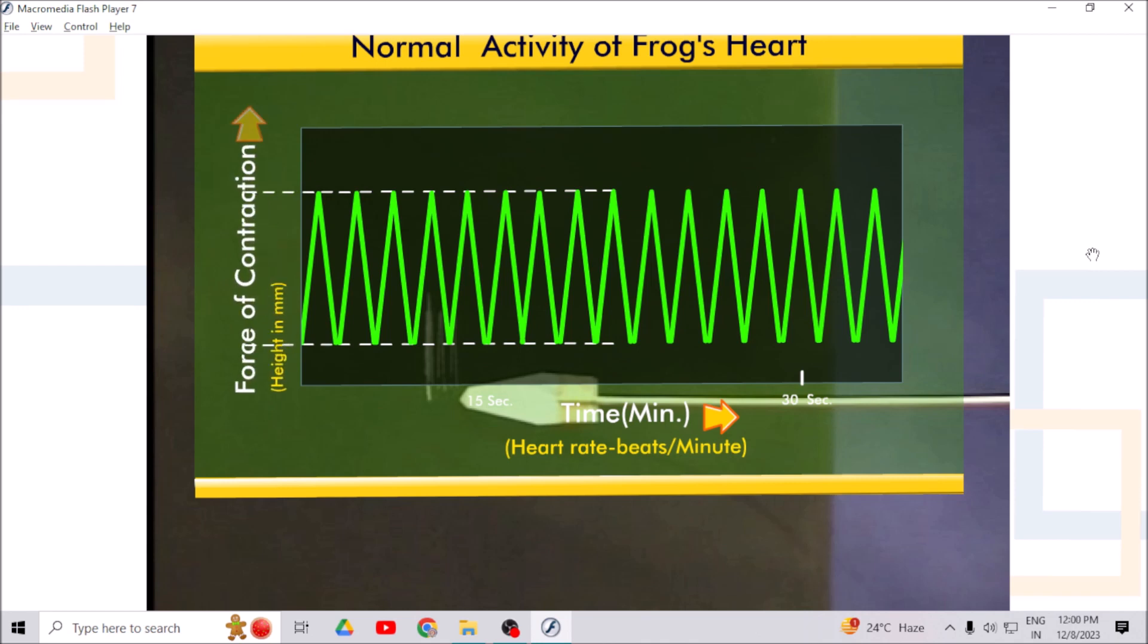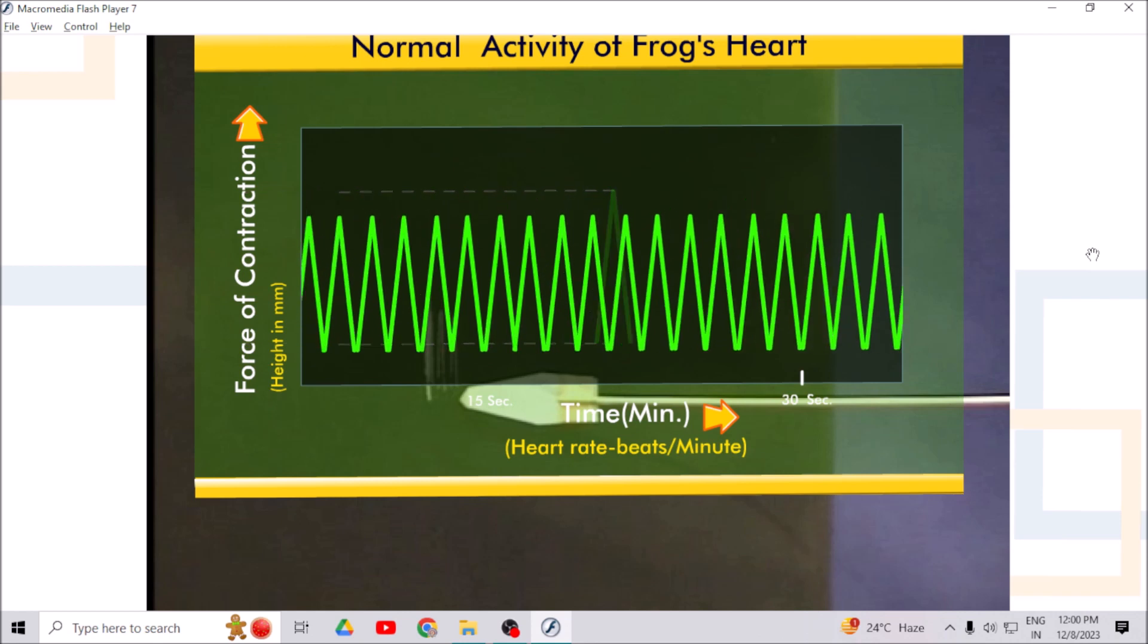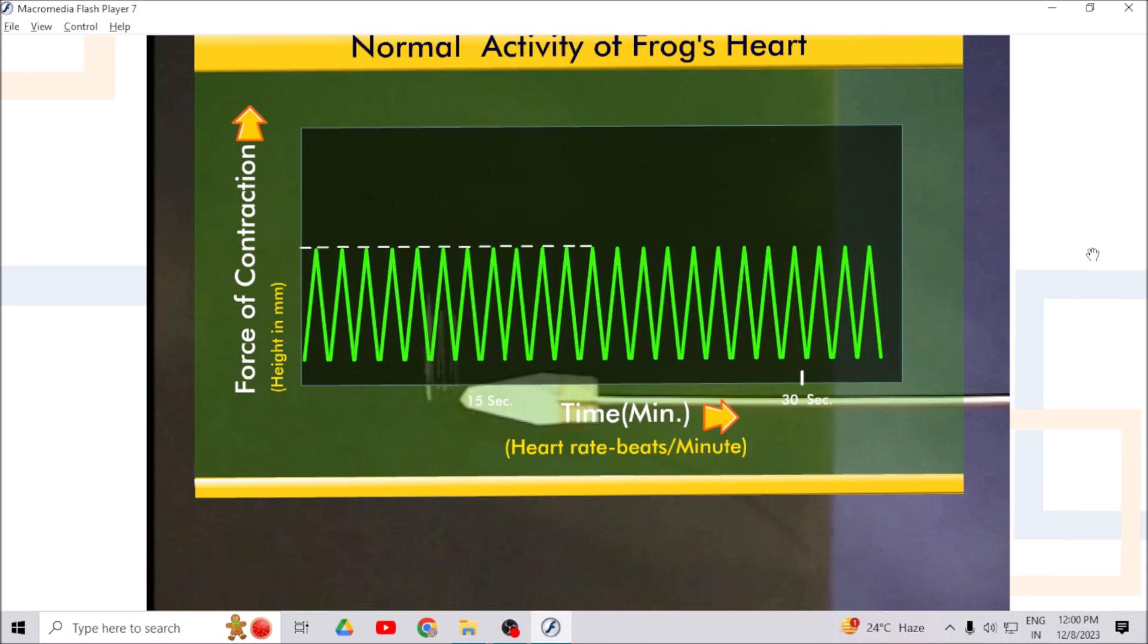You can see that all the peaks in the tracing are of the same height and at the same distance. This means contractions are rhythmic and with normal tone.